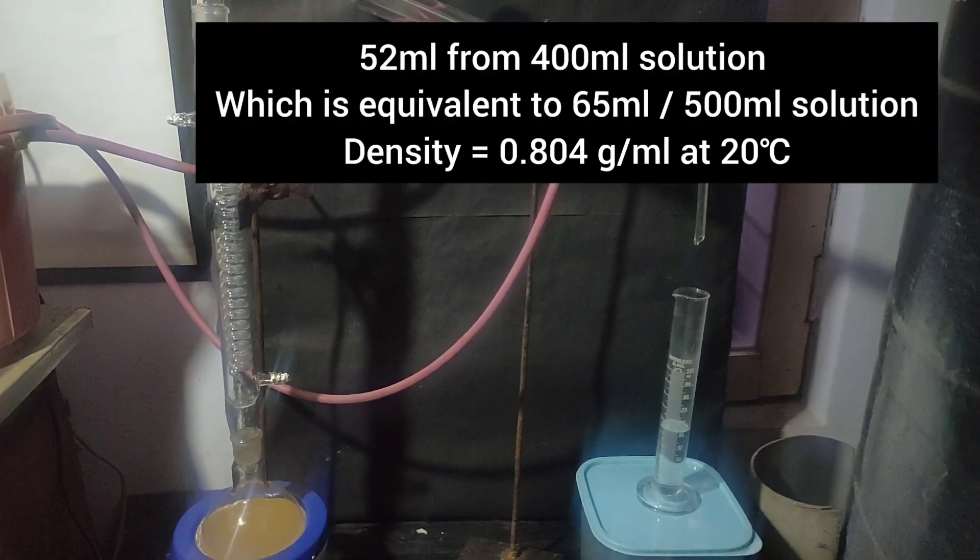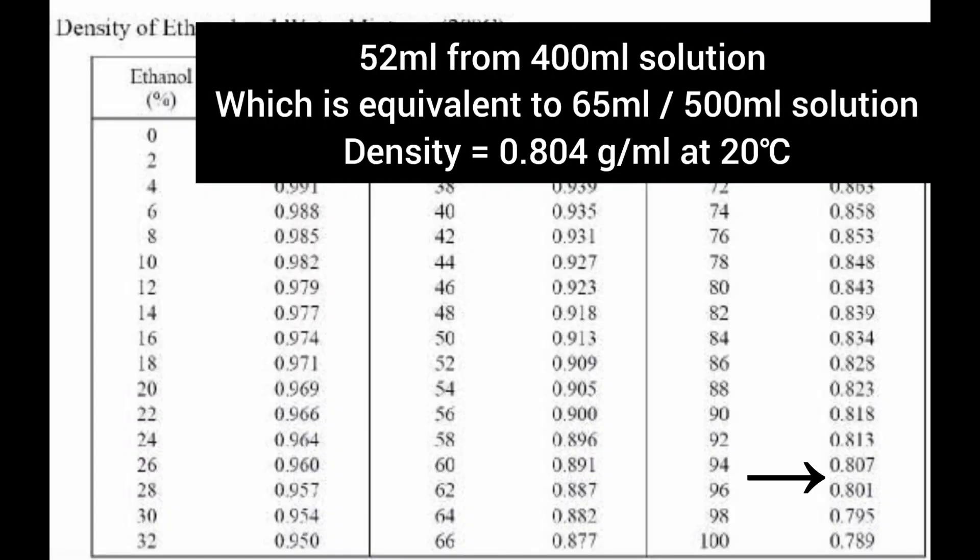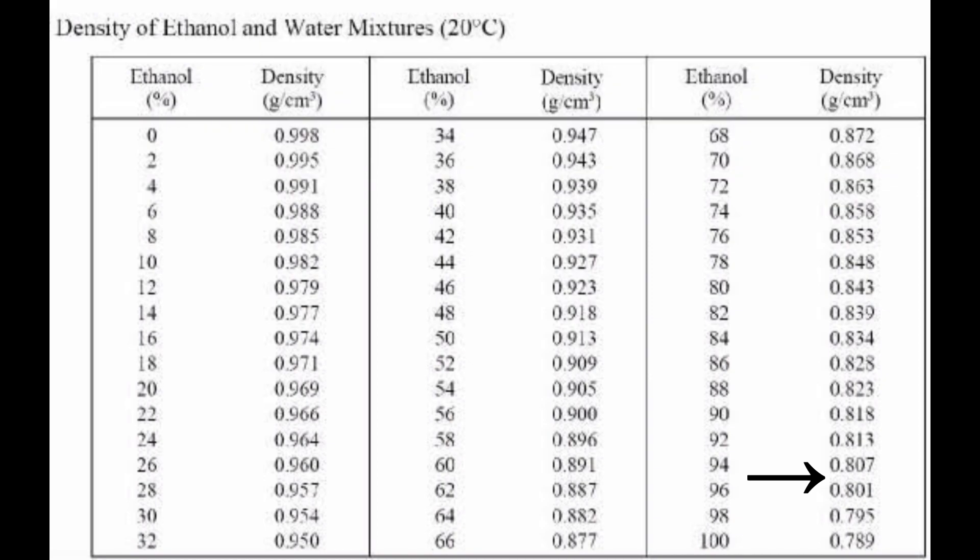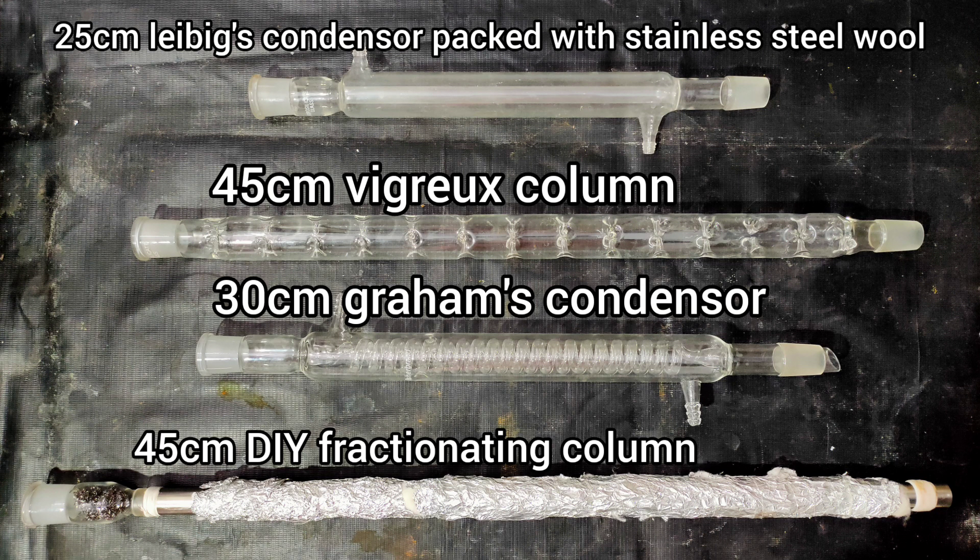When at 78 degrees Celsius distillate stopped coming over, 52ml of distillate was collected from 400ml solution which is equivalent to 65ml per 500ml solution. I checked its density, it was around 0.804g per cc at 20 degrees Celsius. From the table, it corresponded to 95% weight by weight ethanol, which is very close to the azeotropic 95.6% ethanol-water mixture. So in this way, a Graham's condenser can also work as a very good fractionating column, even better than a Vigreux.